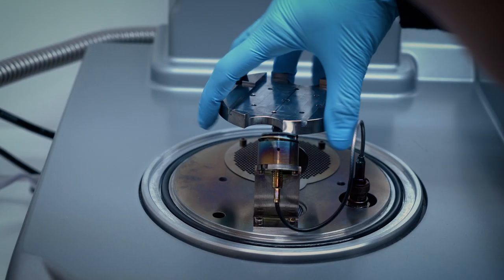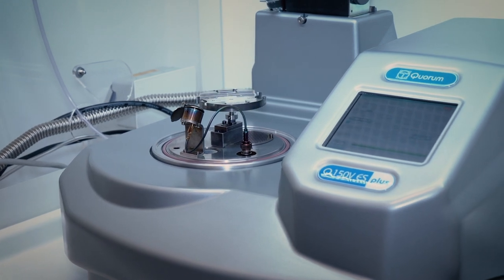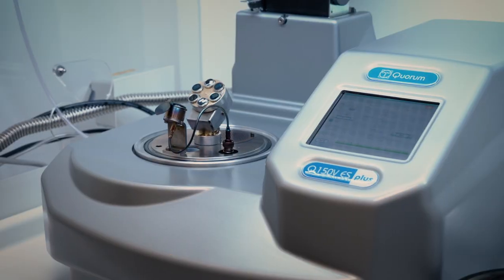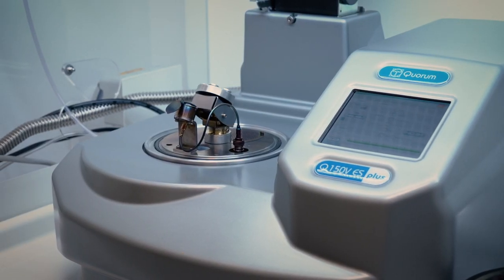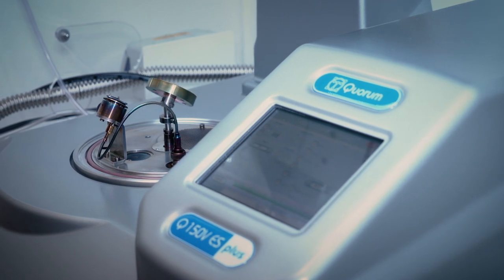The Q150 Plus is equipped with many sample holders from a simple stub holder through to an adjustable angle stage and a rotacotta stage. These options allow users to achieve optimal coatings of the samples.